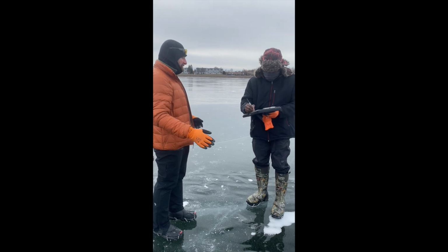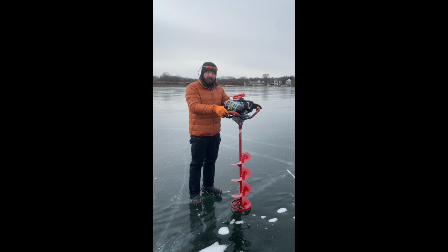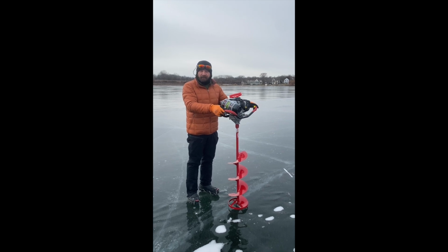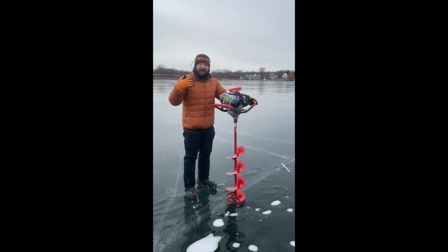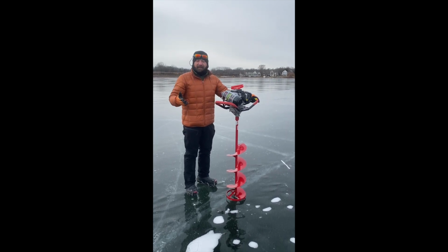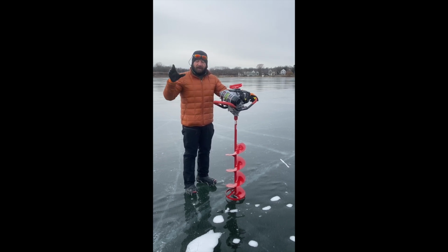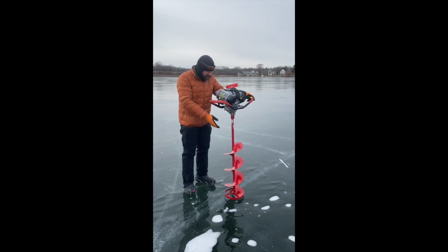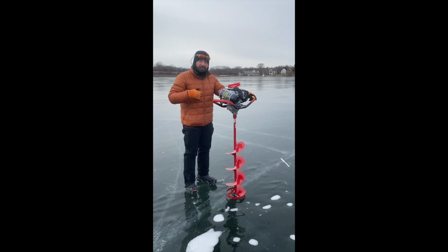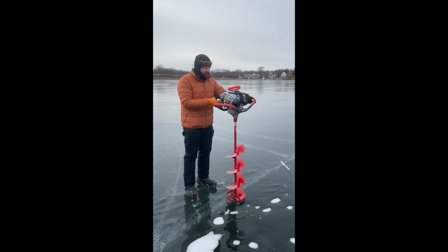Yeah. Nice. We're gonna make a few holes for different purposes. Our first hole is to just get site depth, and we're also gonna do our CTD profile through this hole. Because the CTD is going to impact the bottom and stir up the bottom, and we're collecting near bottom water, we're going to work in different holes. Now we're also going to make a separate hole for light and ice quality observations. Generally you could use the same hole for that, but for a reason I'll explain in a bit, it's actually easier to have a few separate holes.